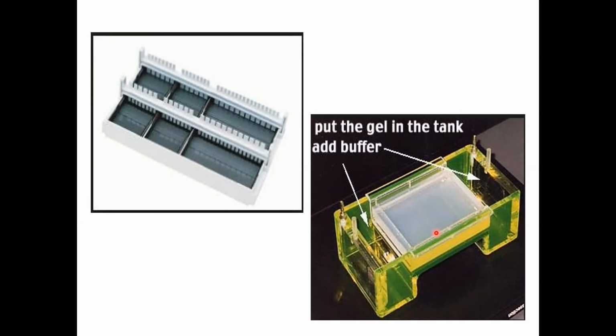If you have gloves, the gloves you use are intended only for gel electrophoresis, and so is the pipette. After you perform gel electrophoresis, you have to trash your gloves again. The pipette that you're using is intended only for this, it should not be used for general procedures. Use pipettes or tips that are intended only for gel electrophoresis.